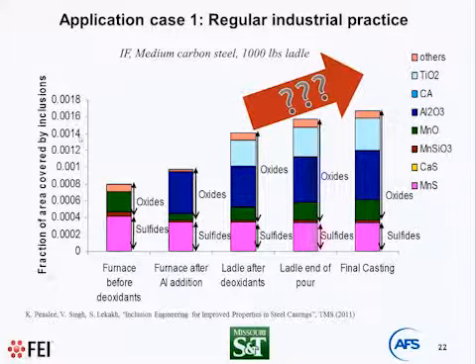The vertical axis shows the total fraction covered by non-metallic inclusions. It seems to be not a big number, but this is approximately 0.1%. It's very significant: if you talk about ppm, it will be 1,000 ppm total level. So when we apply automatic inclusion analysis, we can first evaluate fractions of inclusions and how the fraction changes. You can see, unfortunately, during our process, we have increased the area of inclusions. This is not a good trend, which sometimes we have in our industrial practice. Also, we can see size and we can see chemistry.